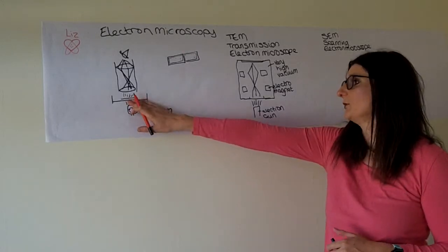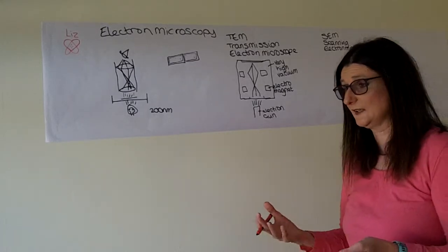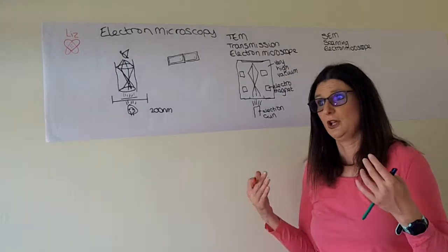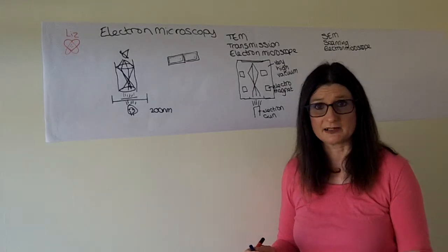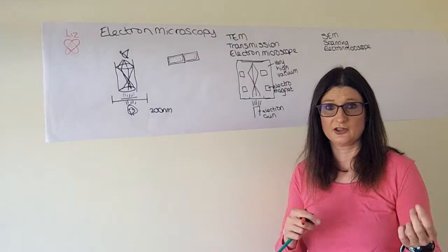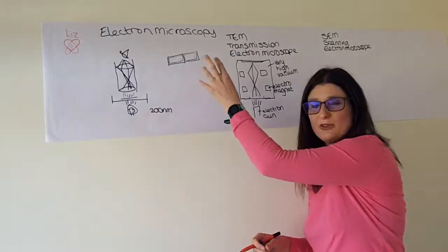So under the optical microscope, you can have a look at a bacteria that's swimming around. They are used for doing samples of sperm, for example, when they're doing IVF and looking at injecting the sperm into the egg. You need to be able to do that on a living cell.